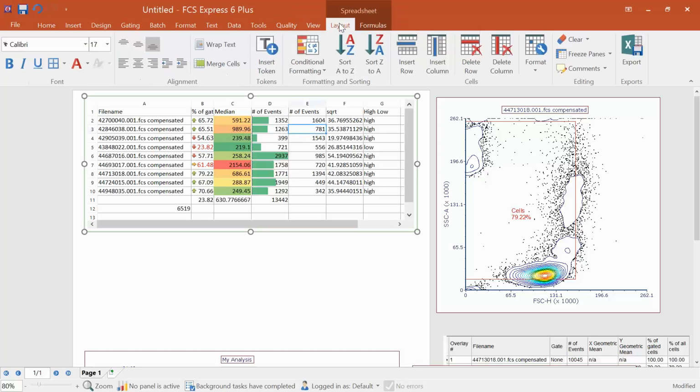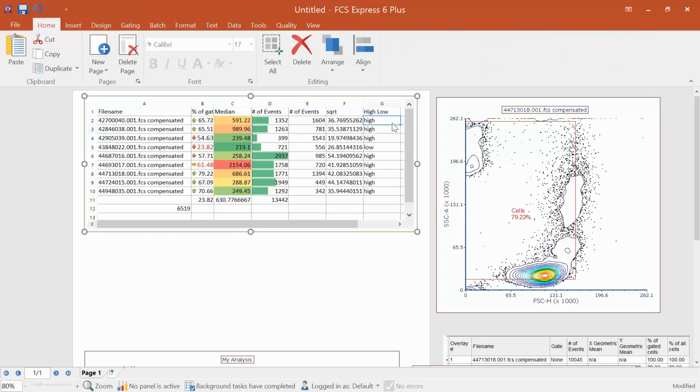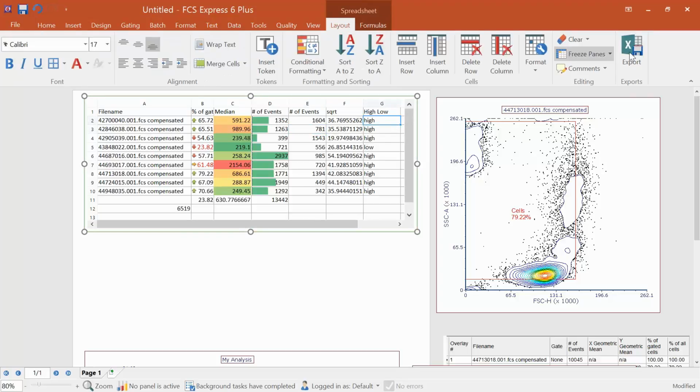We simply click on the Layout tab, and you can see there's an export option. If you're using some other software now, you might be doing a lot of copy and paste. We hate copy and paste at Novo software. We try and make things easy and functional through a user interface here. So you could grab this whole thing, and instead of copying and pasting into something like Excel, we can choose export. And export is going to prompt you to save that Excel file somewhere.